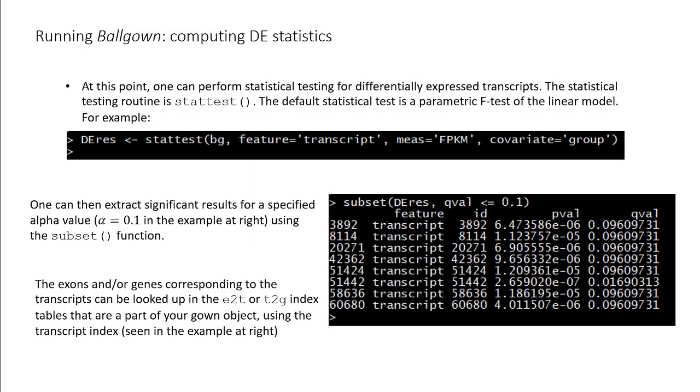Finally, if you'd like to look up the log-fold changes for these significant transcripts, the information is stored in the expr component of the gown object, and can similarly be looked up using the transcript ID.